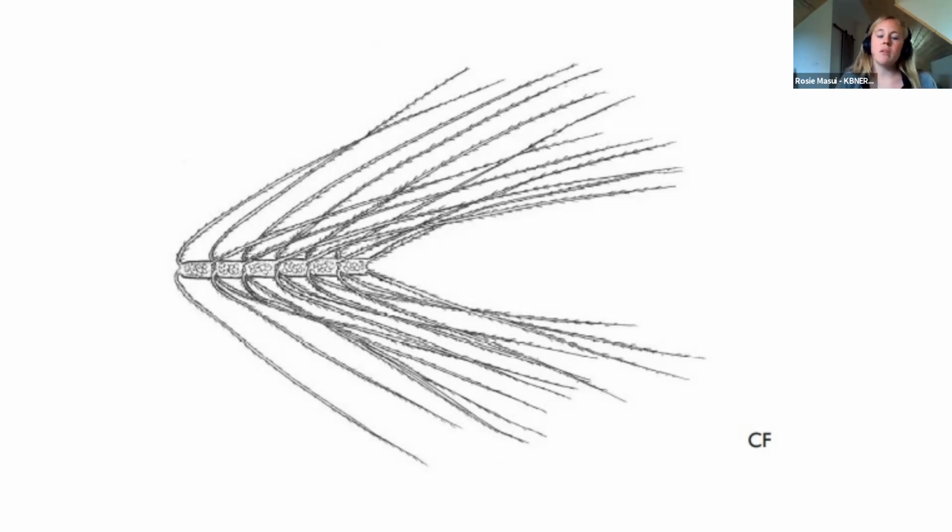Compared to some of the other species that we were hearing about, this isn't producing toxins. Chaetoceros is also super important in the marine food web, and it doesn't have a lot of apparent harm to animals that are eating it. But it's really that situation with fish and net pens that can cause some problems. There are also situations where those spines, when they are causing those lacerations on fish gills, can introduce bacteria into the bloodstream of fish as well. So that's another way that they can cause some problems.